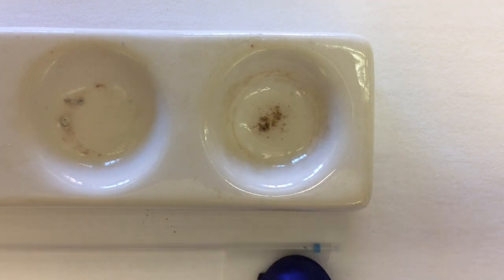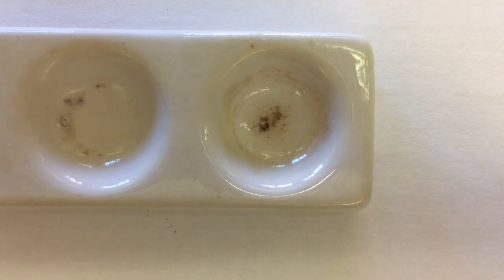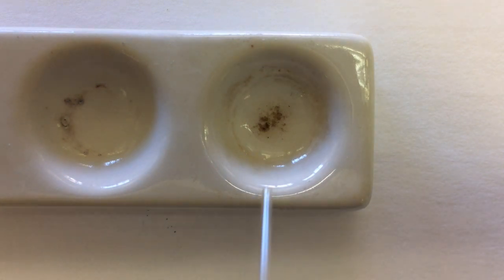Once you add the ethanol, wait a second or two, and then pull the mixture into your capillary and test your lichen. It's just that easy.